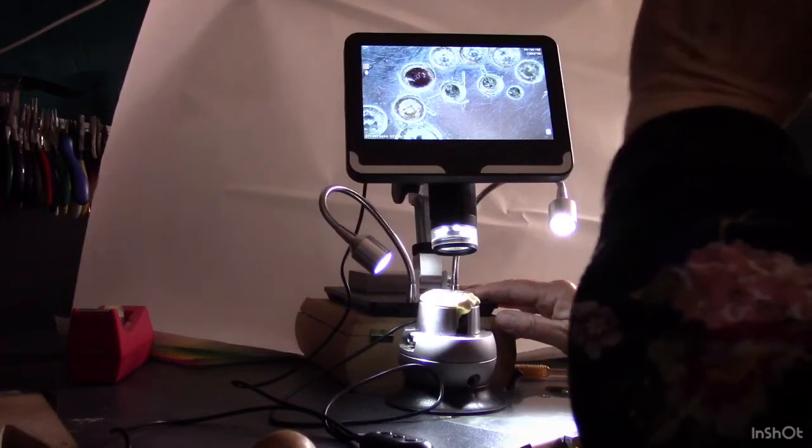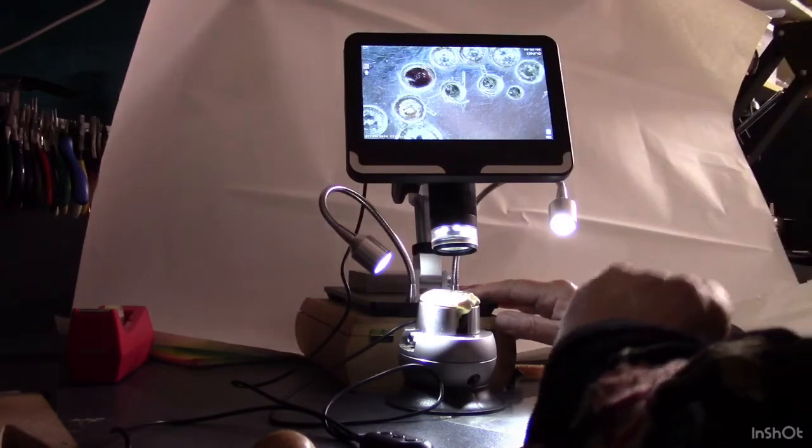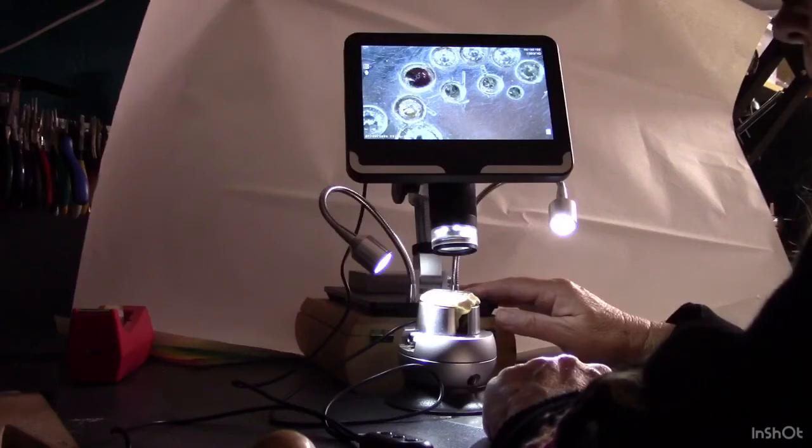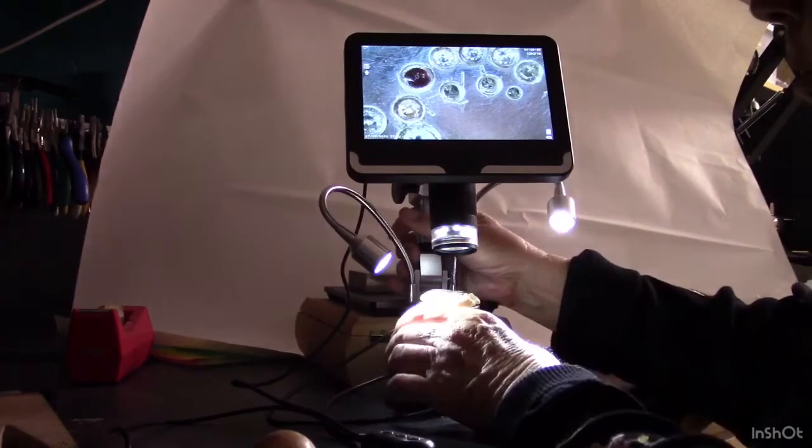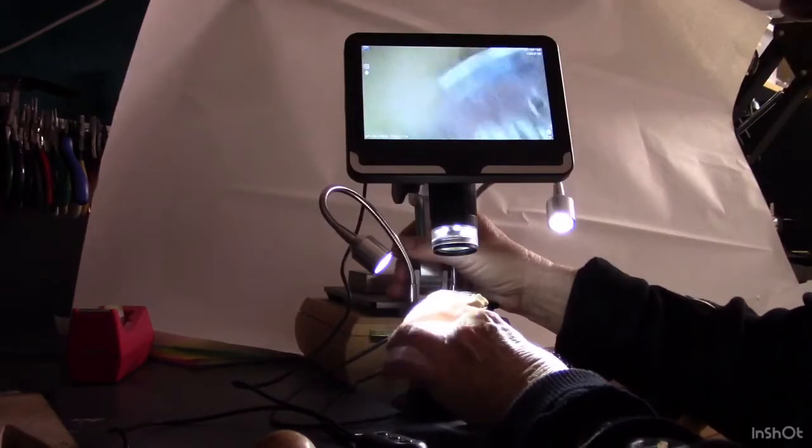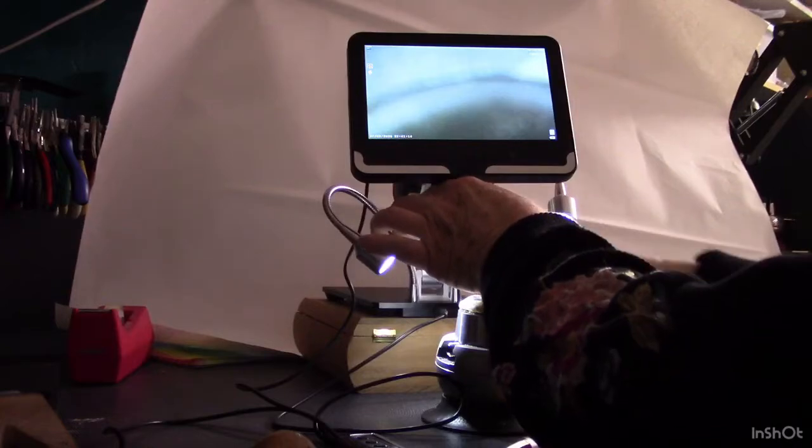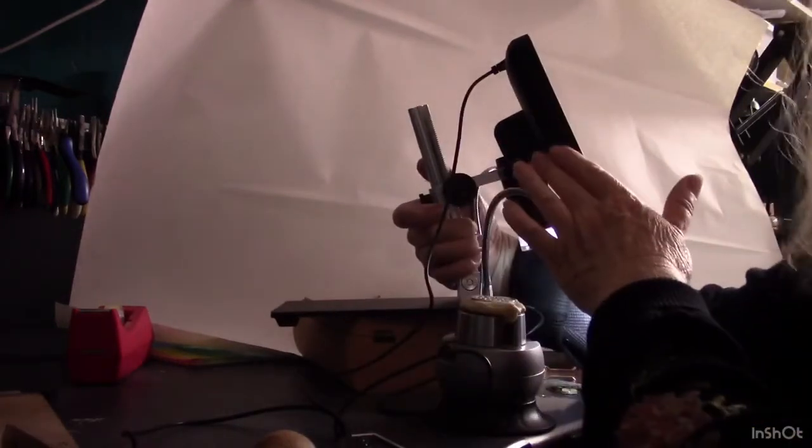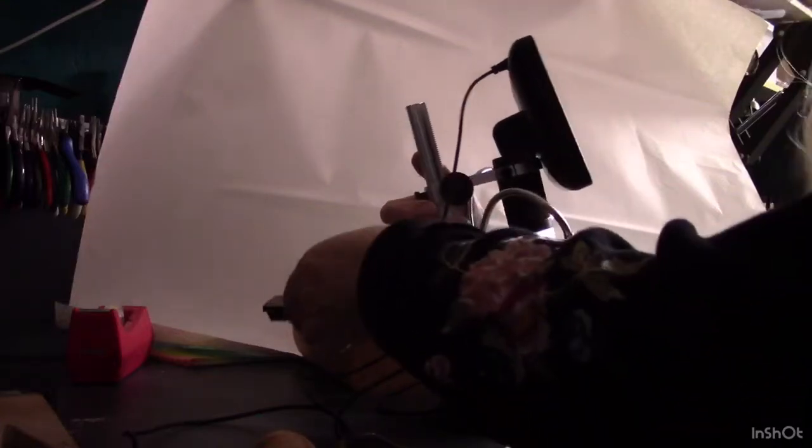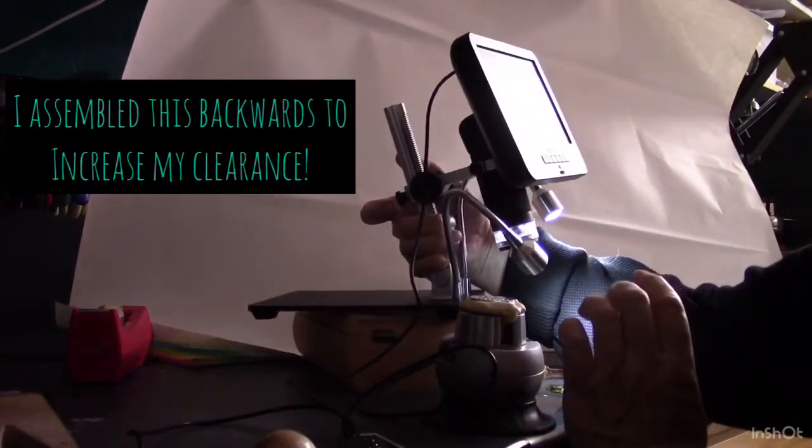But the really cool part about this is that I can work under it. So the instructions for assembling the thing are to put it together so that the microscope is over this little table.